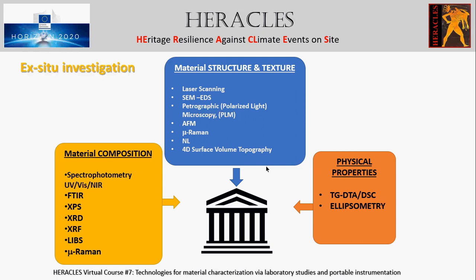In fact, considering the material degradation due to pollution, the transformation of the outermost atomic layers of a stone material induced from absorption and deposition of air pollutants and particulate matter can be detected by means of X-ray photoelectron spectroscopy.